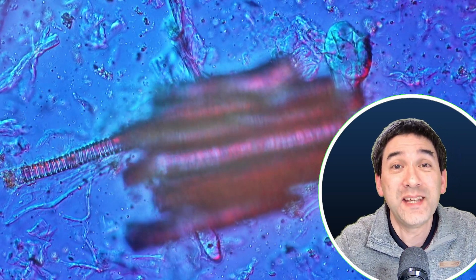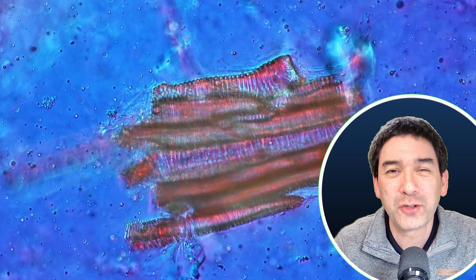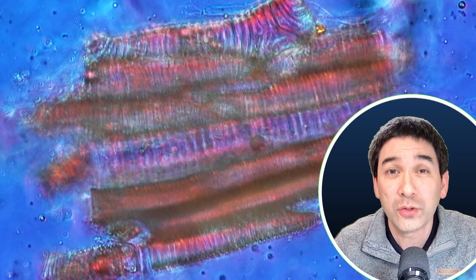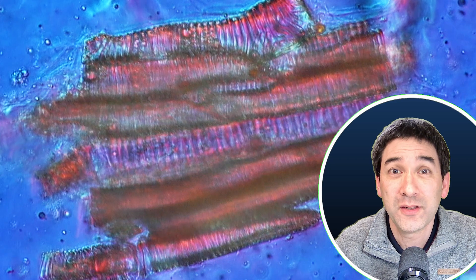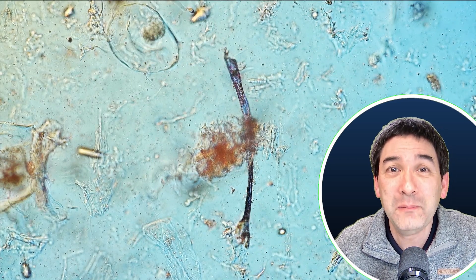And after a couple of minutes, yes, I found something — I was so happy when I found that. And maybe some of you will also recognize what this is. This is so-called xylem tissue. Xylem cells are the cells that transport water up a plant. So this is indeed evidence that we're looking at plant-based meat here.